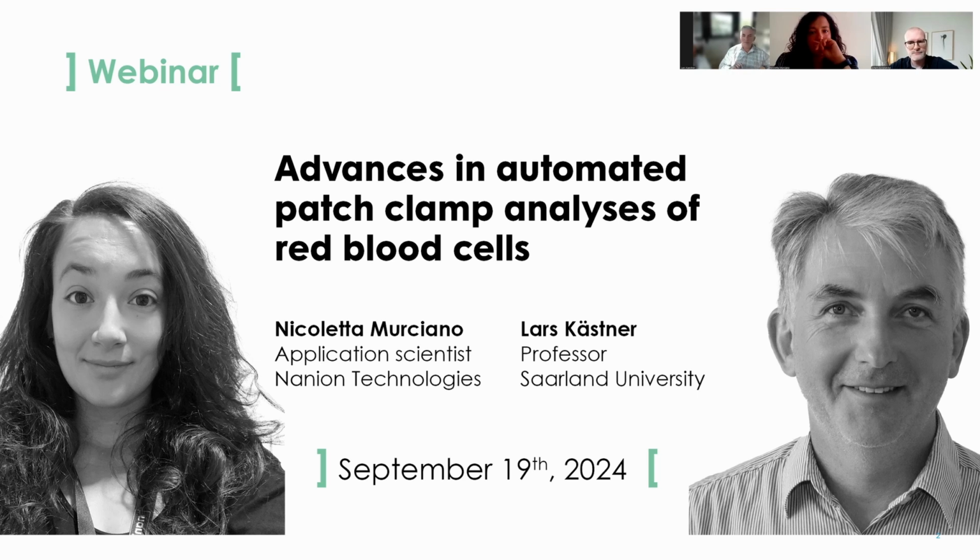And what I also like to mention is we see it, for instance, in other channels that we do see differences in the channel properties, let's say the sensitivity for drugs that are different in red blood cells than in other cells. So I could imagine even if we have a discrepancy of, let's say, 15 millivolts for the polarization that you know from excitable cells, it could still be possible by modulators in the membrane, the lipid composition, lipid rafts, whatever. I think there's lots of things we don't know yet.